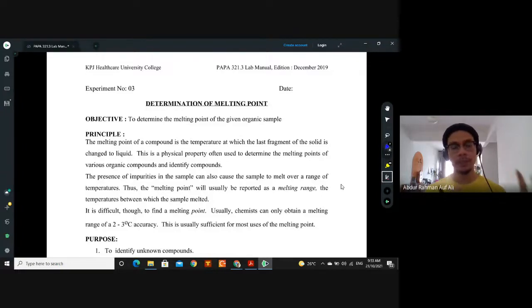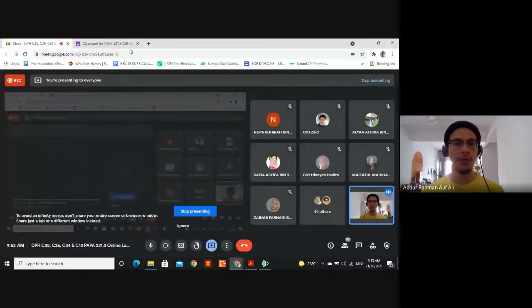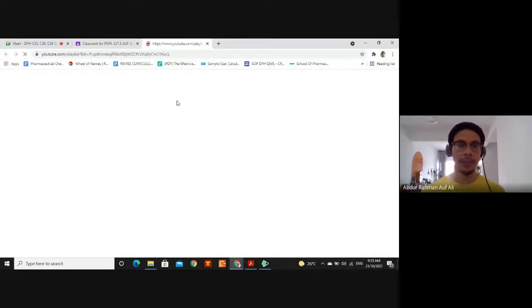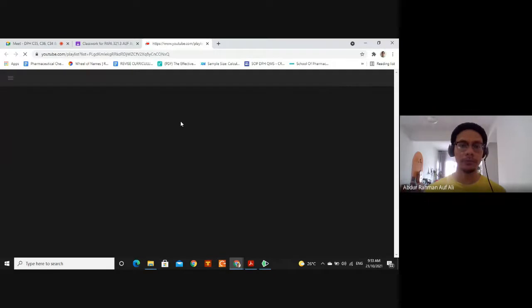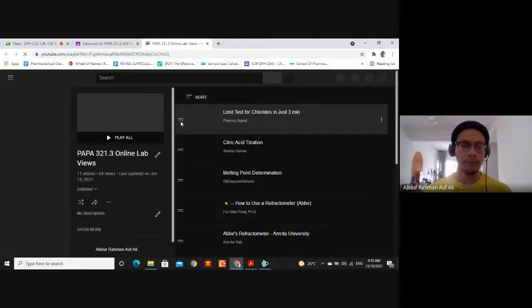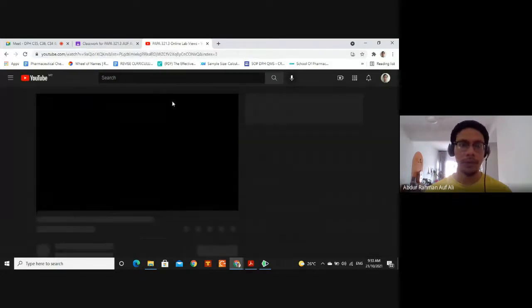In the lecture notes, there's a PowerPoint copy with the video of how to perform this. But I have closed it. But as if we had class today, I want to show you a video of the instrument. It's an old instrument which is similar to our melting point instrument in the lab.